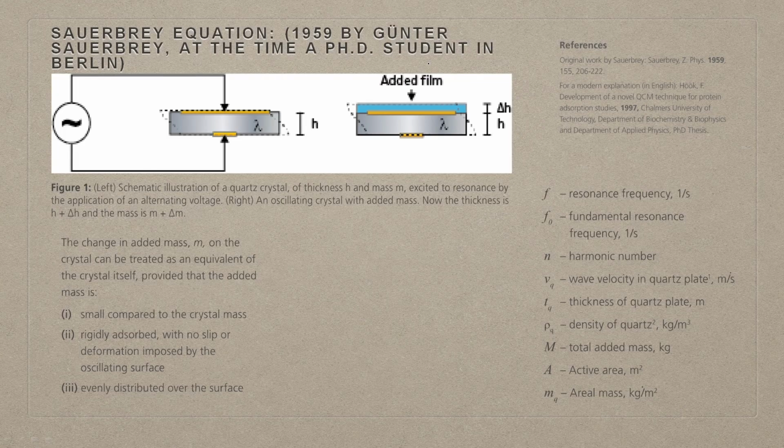So welcome back. We are into the third week. As I mentioned in my earlier class, from this section we will be talking about, before I get into in-depth detail of what a quartz crystal microbalance is, I believe most of you in your 11th or 12th standard must have heard about piezoelectric materials at some point or other.